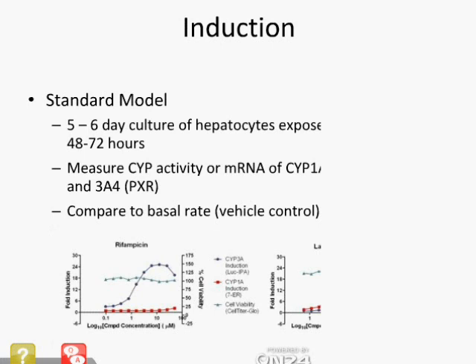Further investigation is needed to determine if this is an inhibition or suppression event. From the literature, it can be shown that rifampicin is an inhibitor of 3A4 at high concentrations, and therefore inhibition is the probable reason for the lower induction observed at higher concentrations.